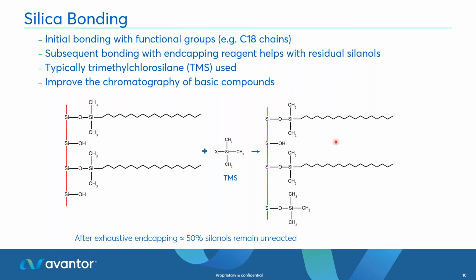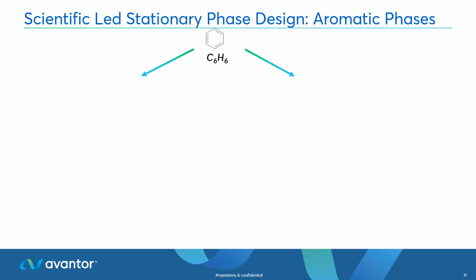But as I've mentioned, C18 gives you hydrophobic interaction. It just gives you that one mechanism. And if it's not enough and you're not seeing a good separation, and especially when you want to go to method development, it's good to choose a column that's different. And that phenyl ring is something that really works nicely in method development. So when we were designing our stationary phases, we kind of started there and said, well, this is really good. I can have pi-pi interactions.